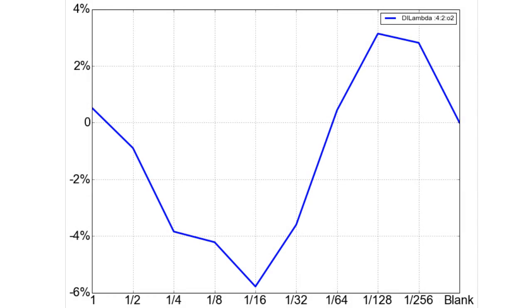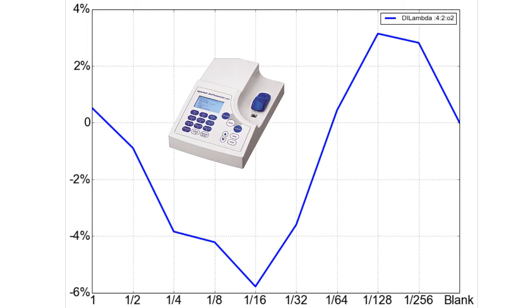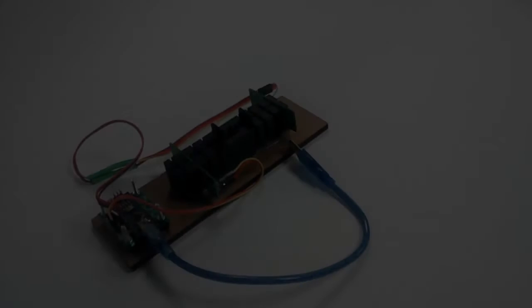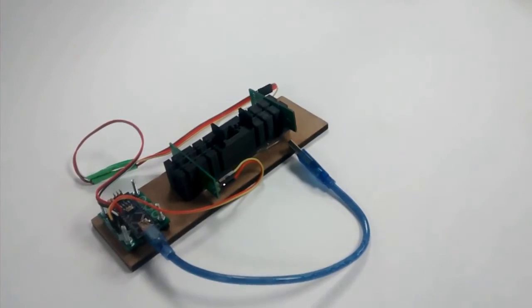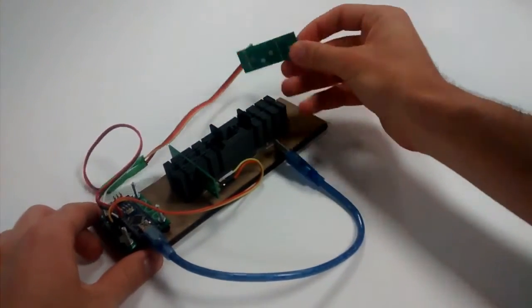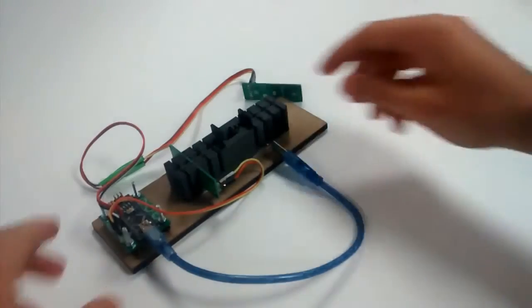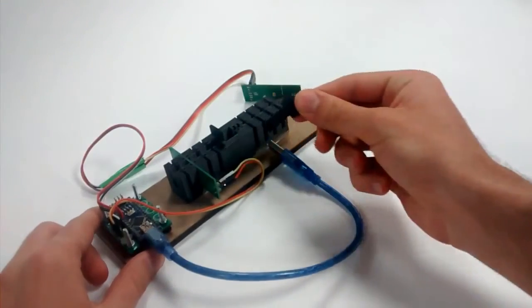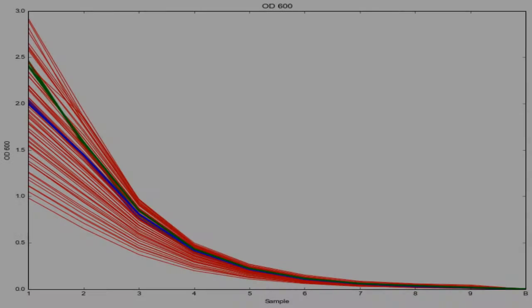First is the calibration. The current version produces results that match very closely the data from our laboratory spectrophotometers. We used a test rig to see how far the LED and the sensor need to be from the cuvette to produce the right results. We also pass the light through two slits, and their diameter is critical to get the right measurements. In this process we found a set of parameters that give just the right numbers.